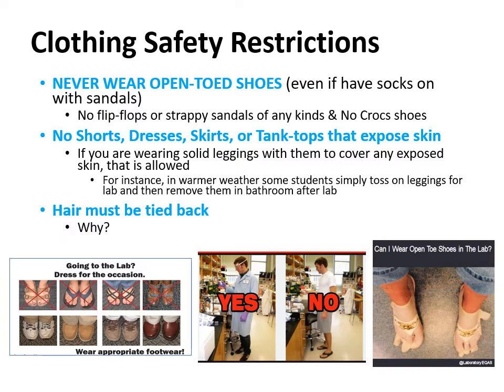Never have exposed skin, whether it's your legs or your arms, because again, your lab coat's not going to cover everything. So make sure to wear proper clothing. And if you have long enough hair, make sure that it's tied back, because hair can easily end up in any of your experiments. You don't want, for instance, if you're working with bacteria, for your hair to flop into your bacterial plate or culture, and then you track that home with you or everywhere you go. And you work with things like Bunsen burners, and so you do not want to set your hair on fire, okay? So always be very careful.